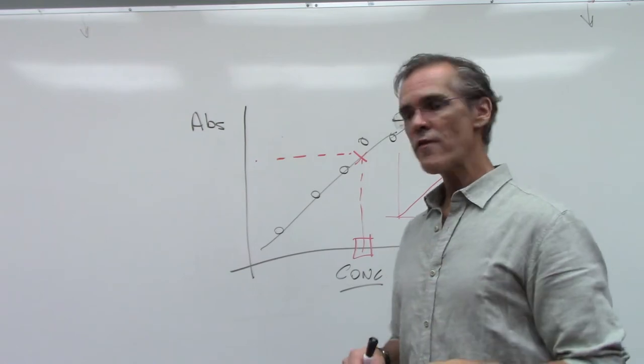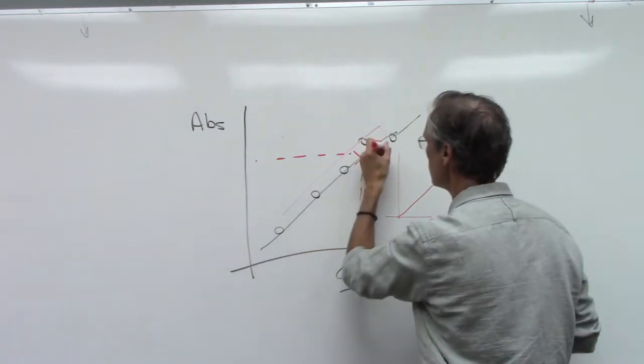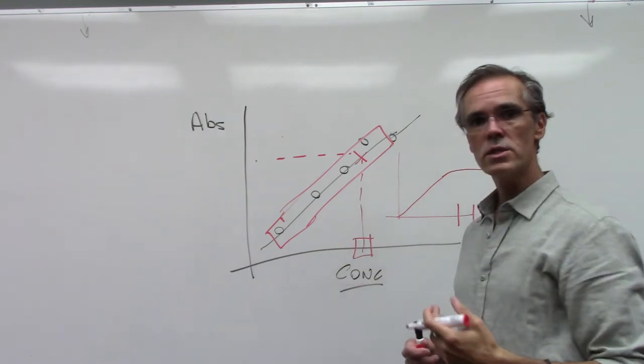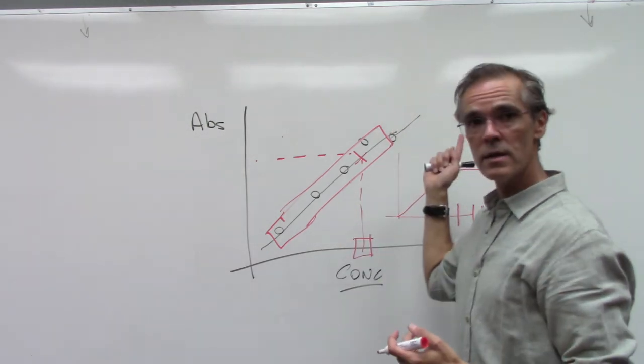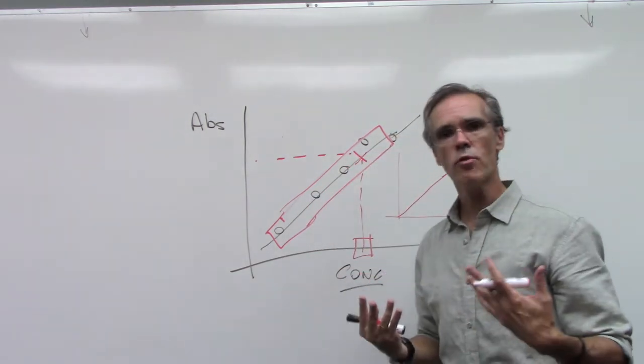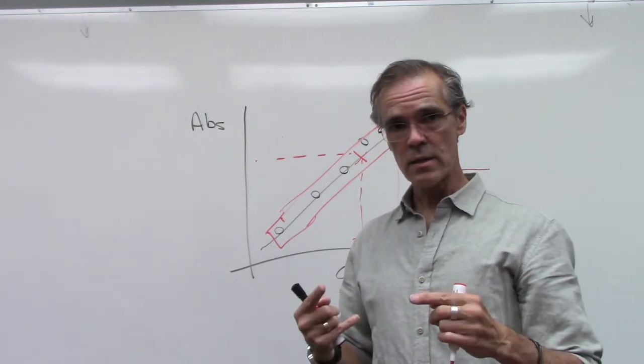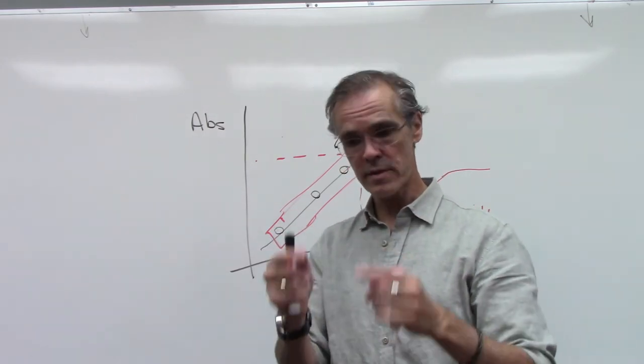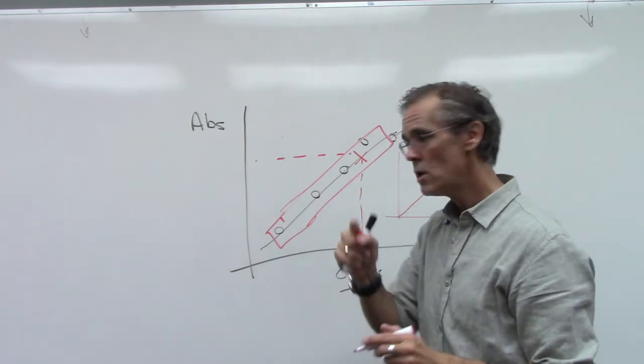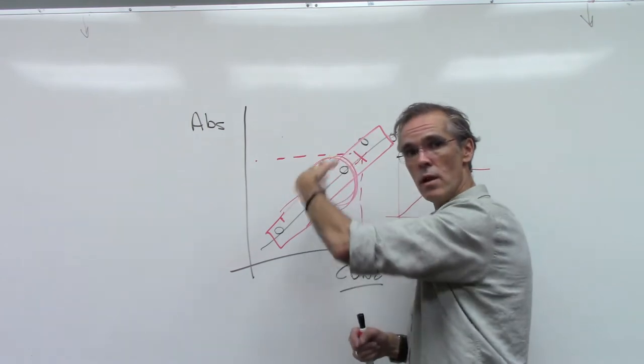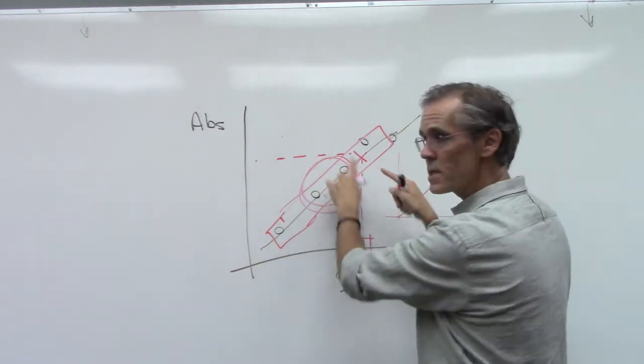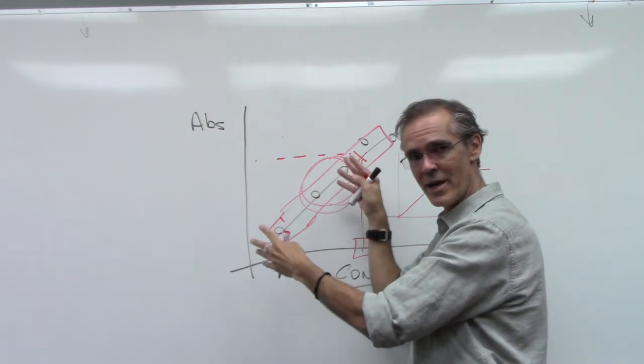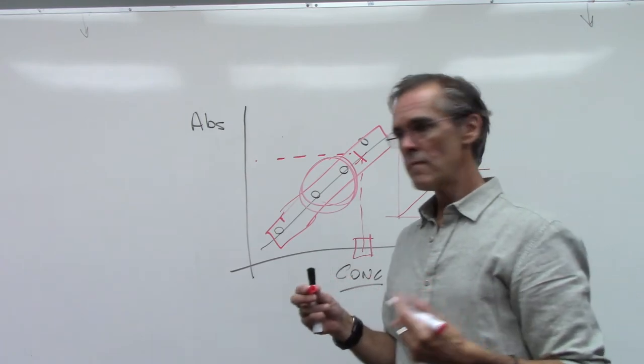Most of the time what we're interested in is having the absorbance and deciding what's the concentration, and then we move on with our experiment. So how do we do this? It's very simple. If you have values higher than your calibration curve, what you need to do is dilute that sample. You dilute, take measurements, dilute more if it's still out, until you hit somewhere around the middle of that area.